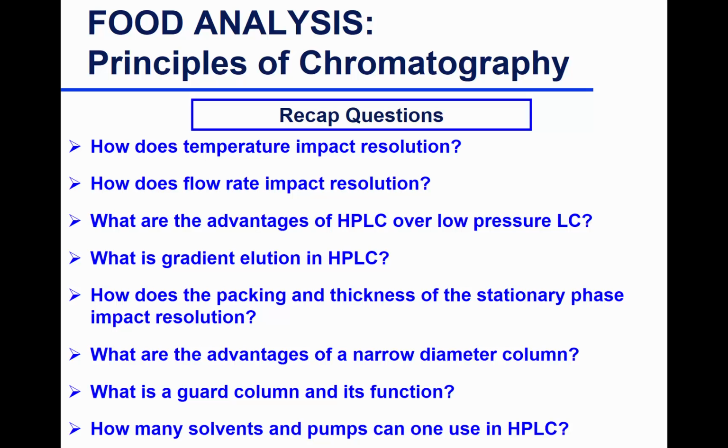So the liquid mobile phase will get less viscous. Yes. So I think that improves the resolution. Yes. So it gets on and off faster. So the mobile phase becomes less viscous. That helps with the mass transfer. So your solutes will be able to go in and out faster between the stationary phase and the mobile phase. So at higher temperature, the solute mobility will be faster, and the solvent will be less viscous, allowing for that transfer to occur at a faster rate. So you reach equilibrium faster, you get a sharper peak and better resolution.